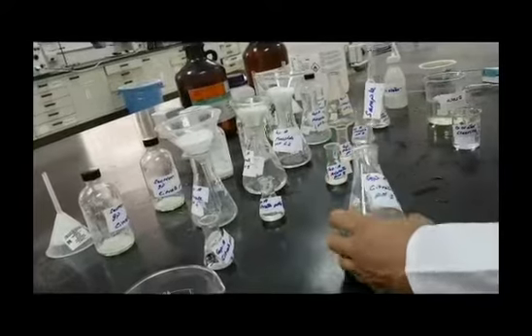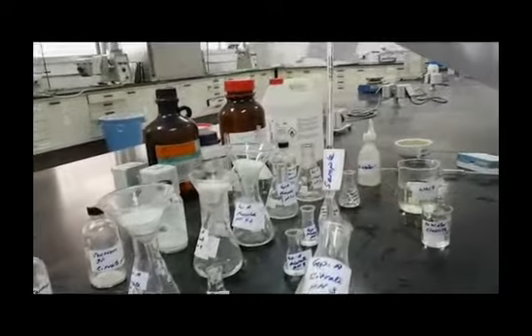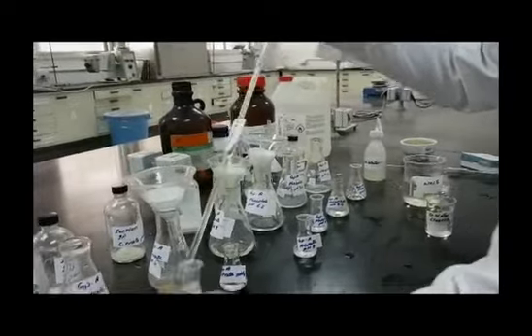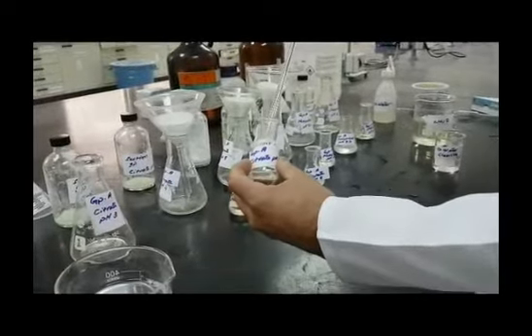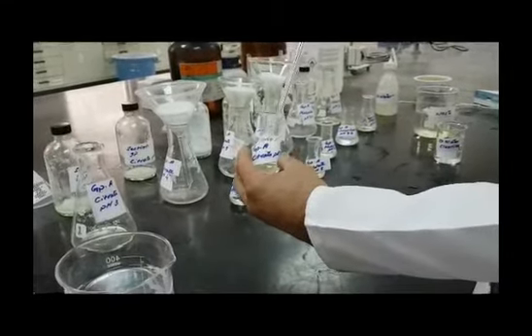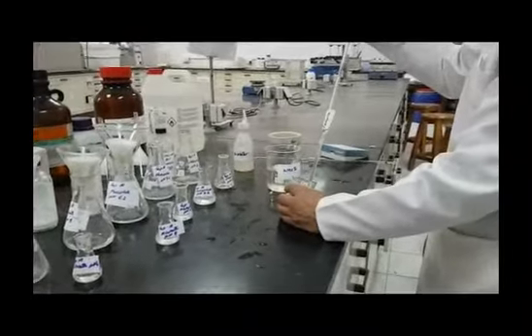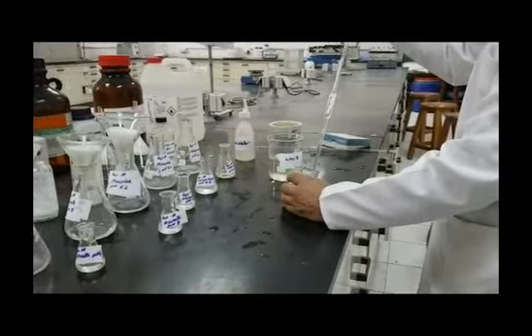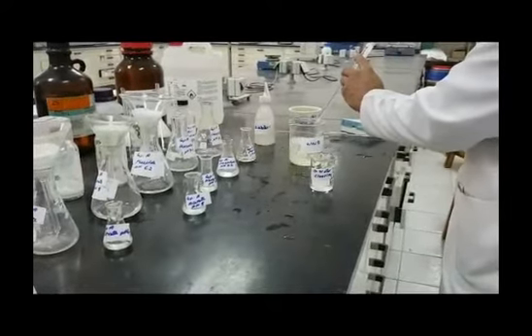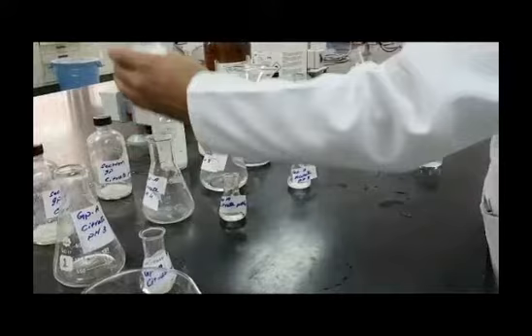As we already know, the most accurate tools, volumetric pipettes and volumetric flasks, as well as analytical balances, should be used while preparing samples, diluting samples, preparing buffer solutions, and constructing the calibration curve. As you can see, the volumetric pipette we are using to withdraw samples is being washed, cleaned, and rinsed using distilled water in between samples.